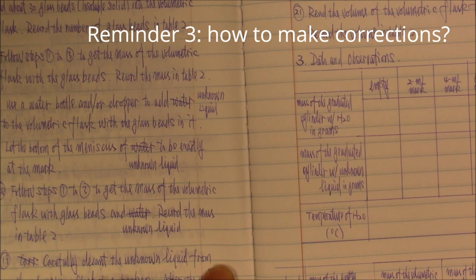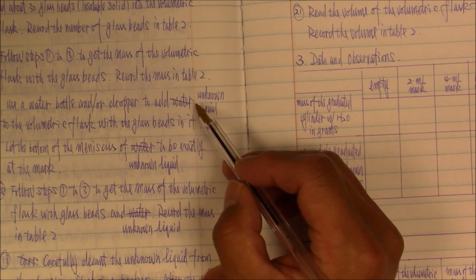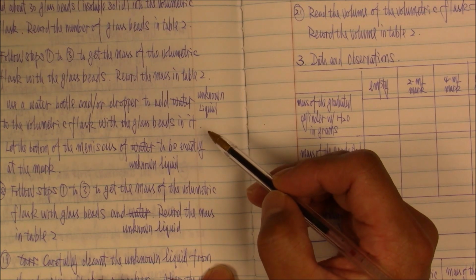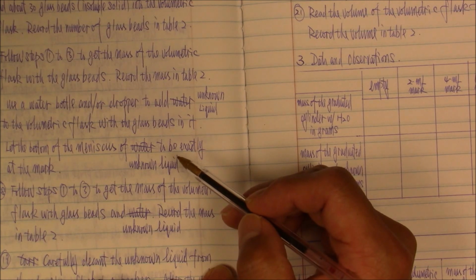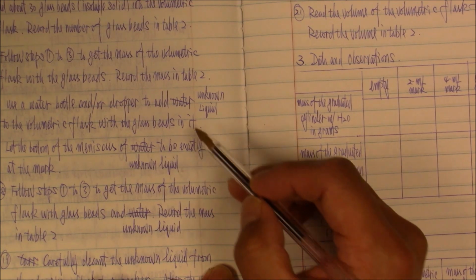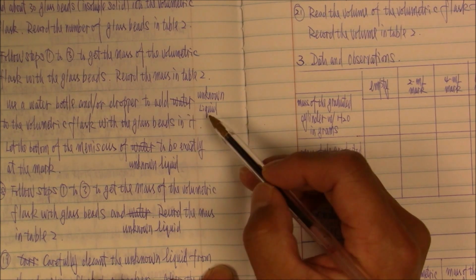Another reminder, it's not possible to avoid typos. If you write down anything wrong, you put a line across the word, then put down the correct word next to it. Do not use erasers to erase the wrong thing completely. Because when you present this laboratory notebook as evidence in the court, people may wonder, did you erase something important? It's hard to defend yourself. So put a line across. You can still read it, but you know it's wrong.